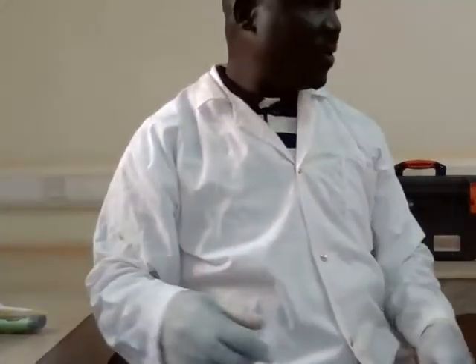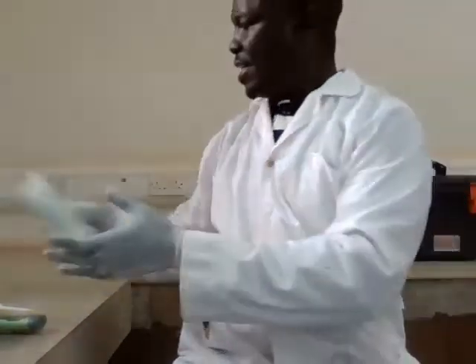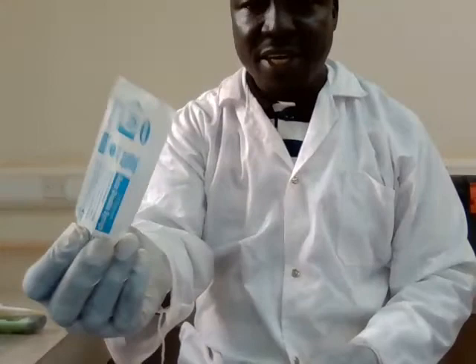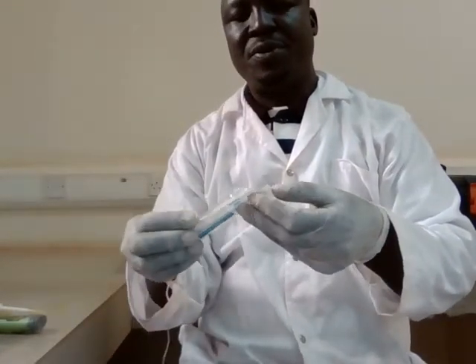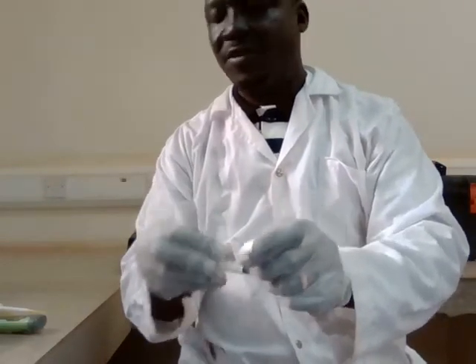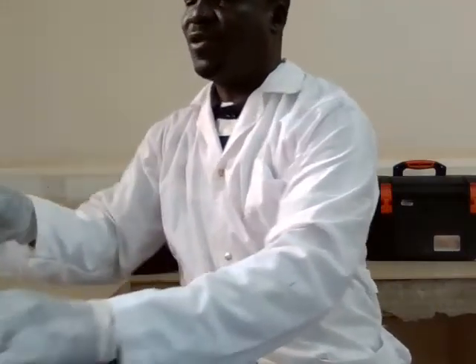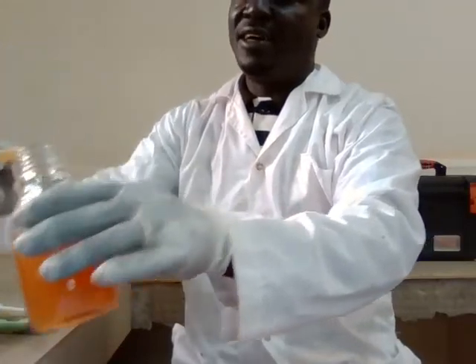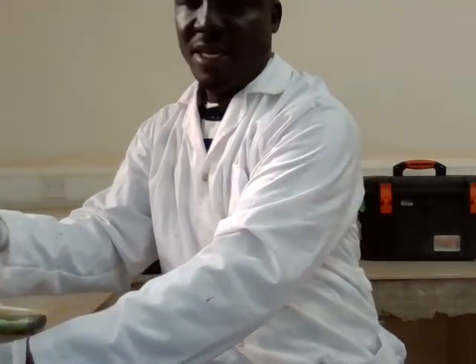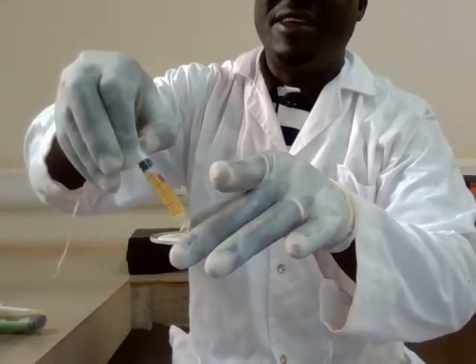You can dispense the media using a syringe, and you can open it up. All is sterile. You can get the volume of the media, about 3 mils, and then you dispense on the surface.